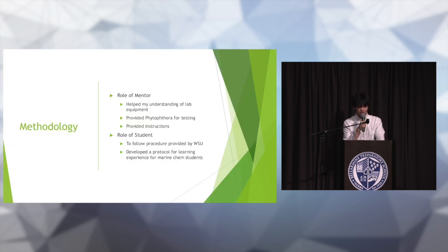So here is everything involved. I started my lab work with learning and going through the biotech piece, and then I learned how to collect the samples. Then I conferred with one of the instructors at Pierce College to understand the process, because they are also doing similar things with Phytophthora in their classes.